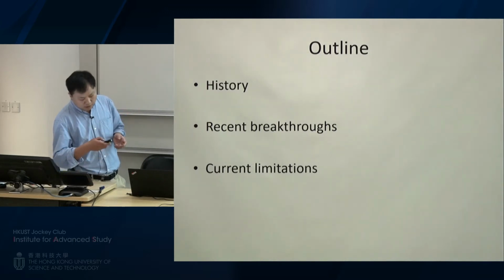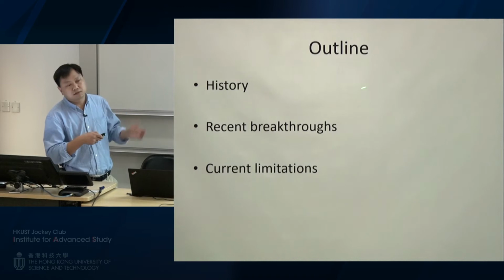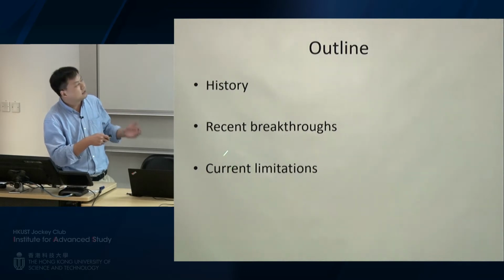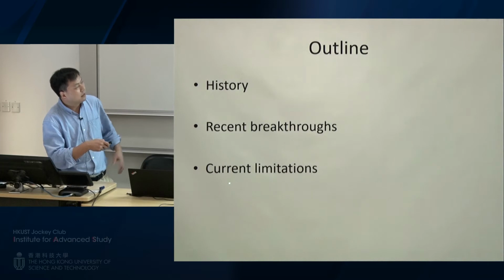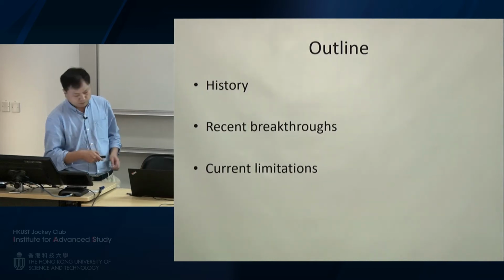So basically, I will give a little bit of history about Cryo-EM and its development, and also why Cryo-EM has been a hot word for many scientists, especially given the recent breakthroughs in the last 3 or 4 years. Then I will discuss the current limitations in Cryo-EM, from sample freezing to data analysis. And probably in the talk afterward, Professor Amit will introduce his solutions to these problems.